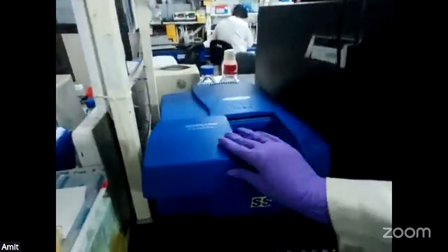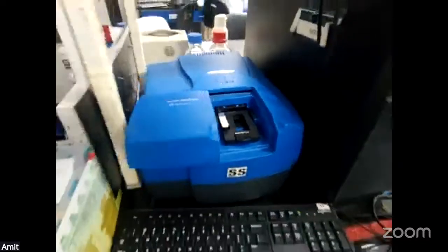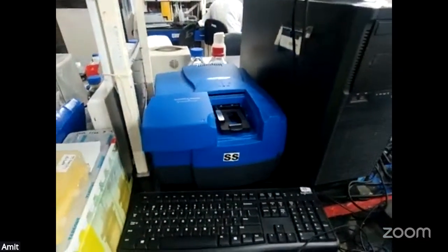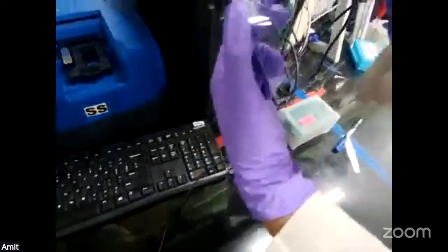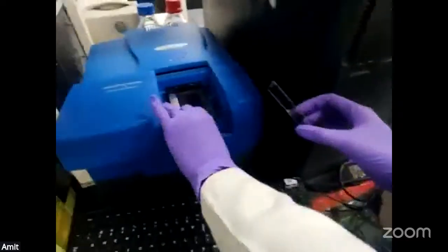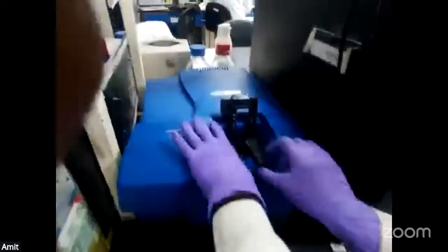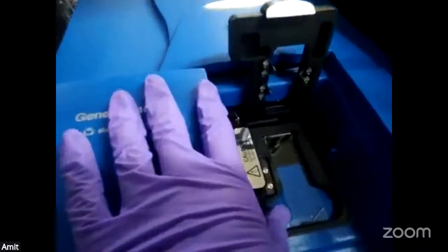Now that we have prepared our slide, this is the scanner, as you can see, and this is the region where we insert our slide. Now I'm going to show you how we insert our slide in the scanner. This is the part where we have our sample prepared, and then we are going to invert it and put it in the scanner. So we have added our slide in the scanner. We'll close this.